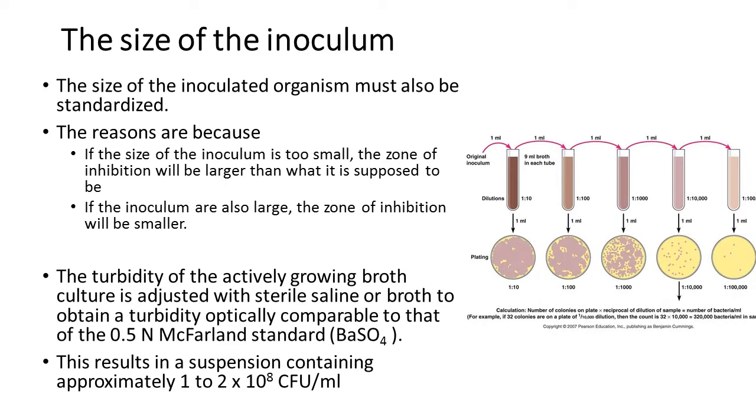The size of the inoculum. The size of the inoculated organism must also be standardized. Here we are using the 0.5 McFarland standard to standardize the inoculum.